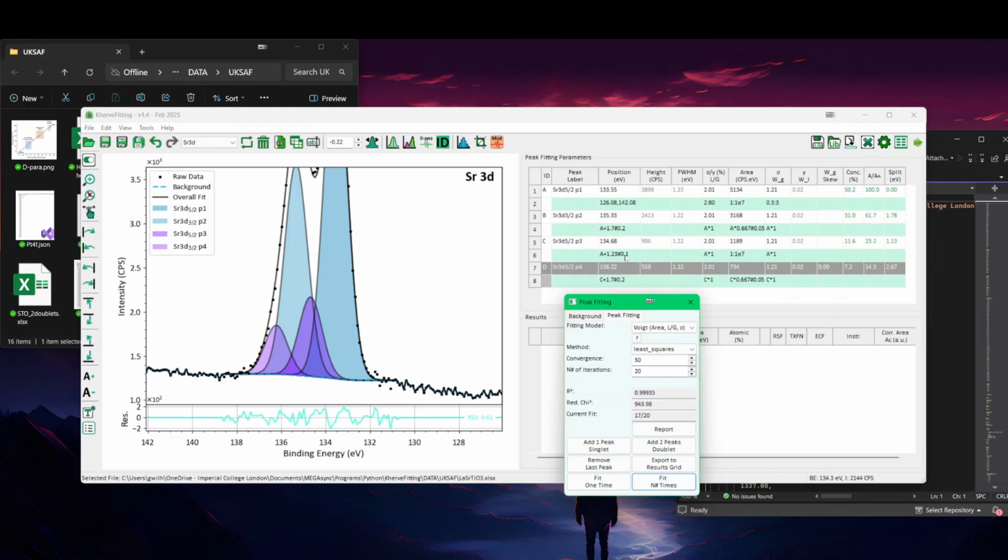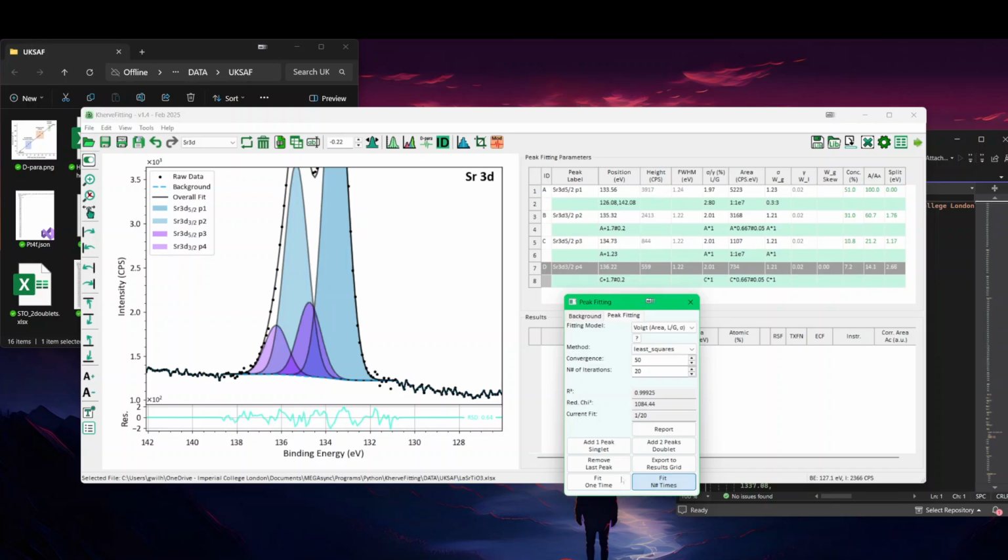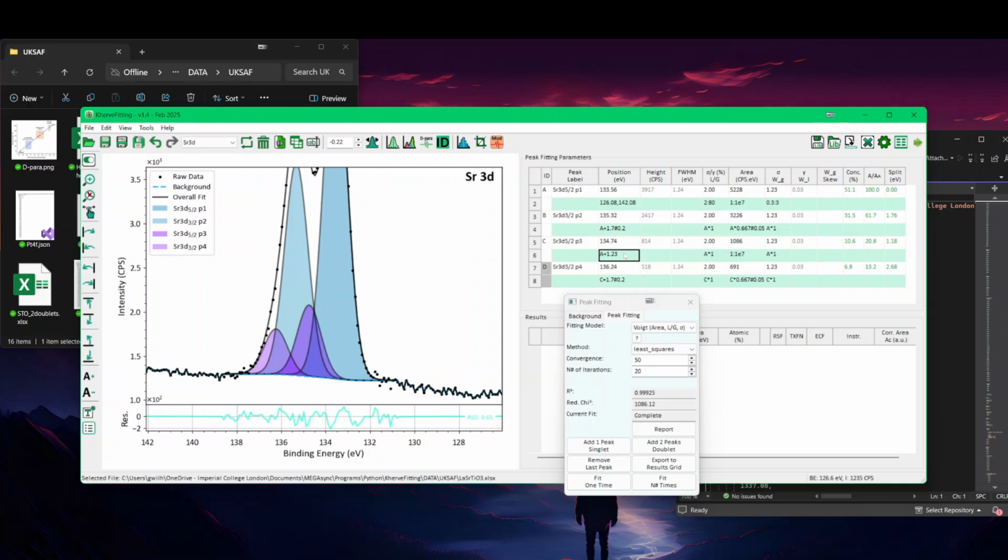It's close to 1.23 because plus minus 0.1. Okay, I could decide to remove that, the plus minus 0.1, and I'll get now maybe a value which is closer to what I would like. And I can decide to simply use hashtag 0.1, and now it will move the value plus minus 0.1 of that value shown here. Okay, so those are the different constraints that we can use.